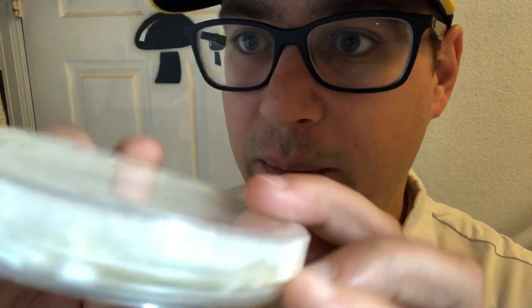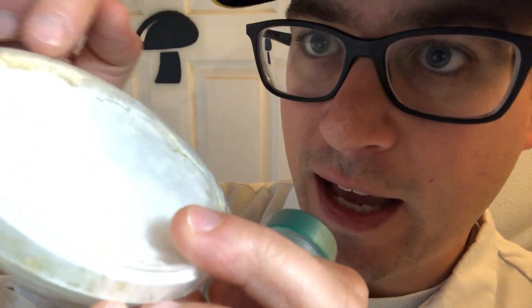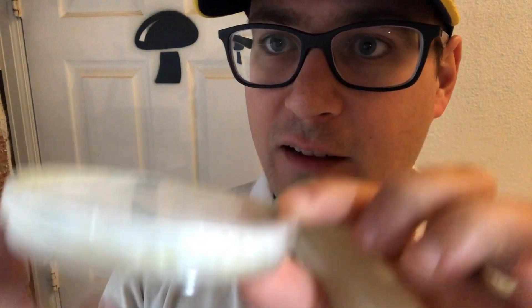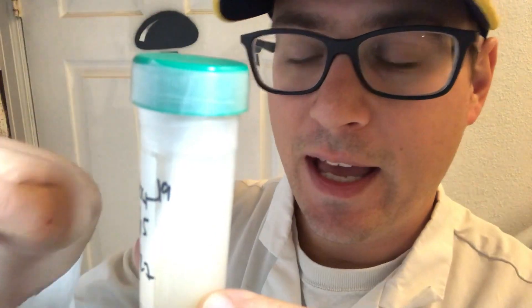This plate is only three months old and you can see the mycelium is starting to come out over the edge. This is because the nutrients inside the agar have been depleted, so the mycelium is stretching and reaching out to find more nutrients. With a slant, there are so many nutrients in the bottom that the mycelium digs down instead.